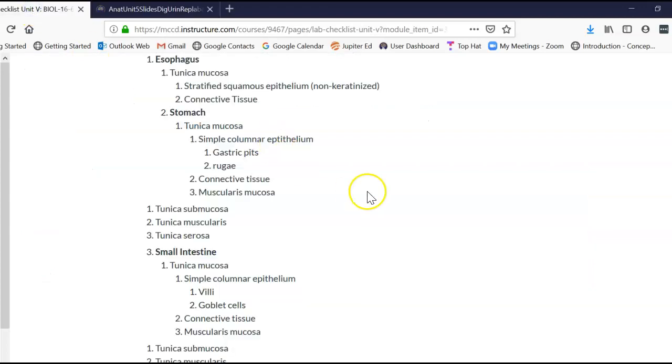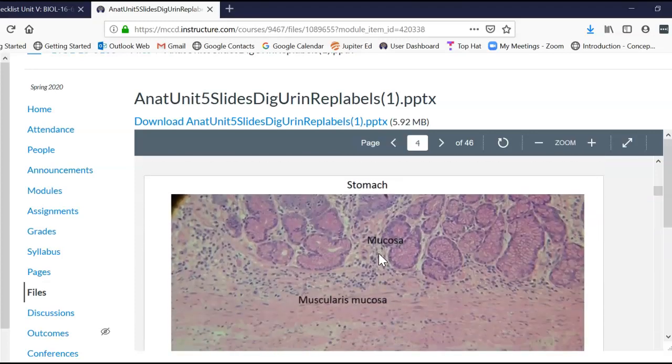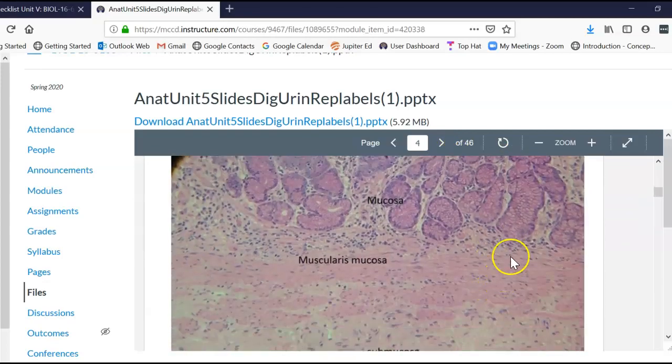You can learn the different cells in your lecture, but we won't be learning the specifics here in the slides. So this is the mucosa of the stomach. Then we go down a little bit, just below that mucosa, and we see the pits that we saw earlier. These pits keep going down, and even though it's a different color here, there are the same pits.